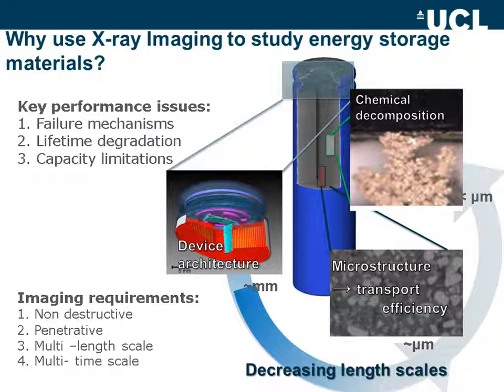Once we are able to effectively combine all of these length scales in a non-destructive X-ray imaging modality, of course, there's a very valuable opportunity at the end of life to do post-mortem imaging as well. And Arno's already pointed to the focused ion beams using gallium ions and helium ions, which enable us to image at really the very finest resolution to explore some of those nanometer and maybe even sub-nanometer microstructural features.